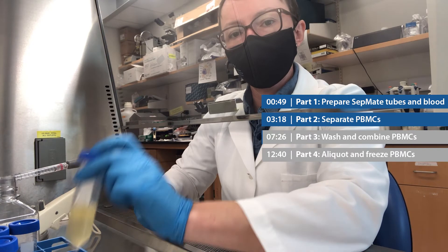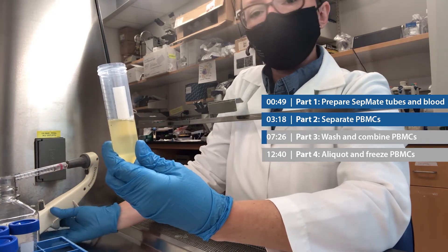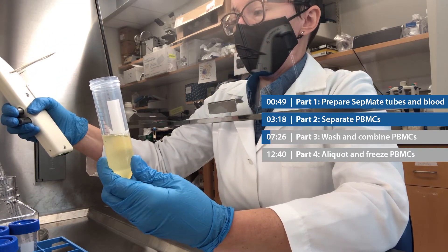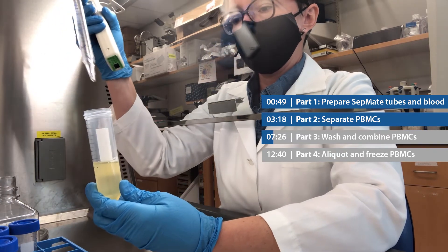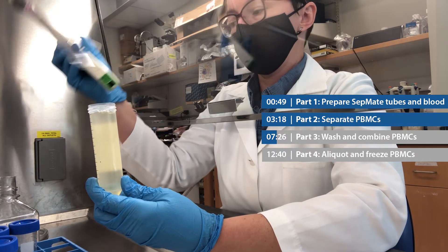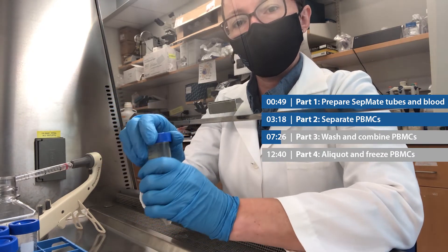Now we're ready for part three, and the first step is to wash our PBMCs. I have my four tubes containing about 20 milliliters of diluted plasma with PBMCs that I poured off of the SepMate tubes. I'm going to add 30 mils of DPBS to bring it up to 50. This is important to wash the PBMCs to remove the lymphoprep. I'm going to repeat that with the other three tubes and then take them to the centrifuge.